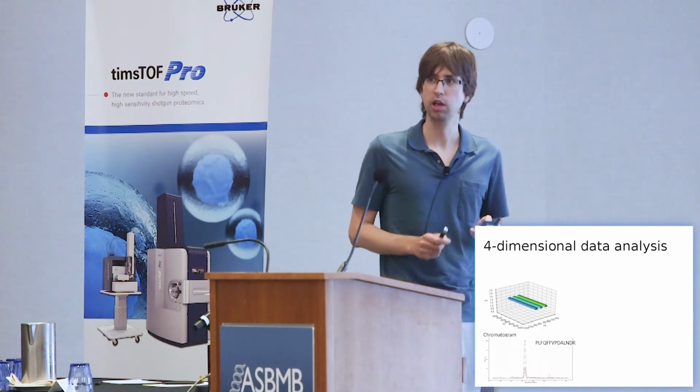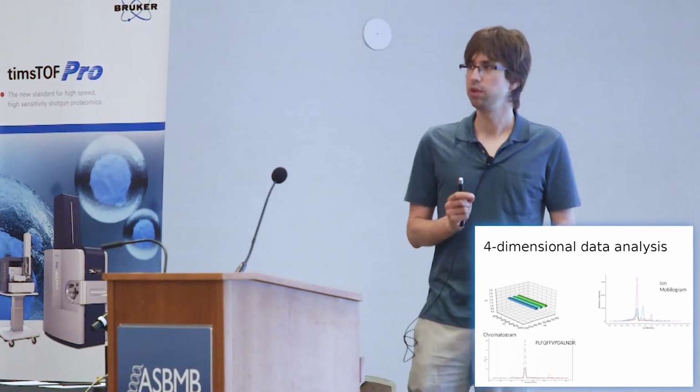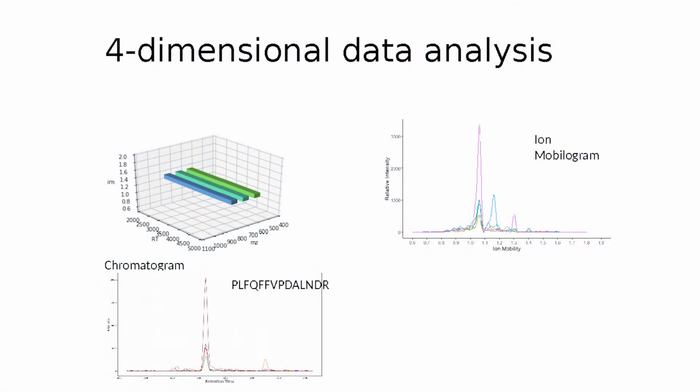However, additionally, we can now look in the ion mobility dimension, and here we see something very, very similar. We see a coelution of the 6 fragment ion traces as a function of ion mobility at the position of the precursor ion mobility. And so we realize that this is the elution time point of the peptide, because all of the fragment ions show a co-eluting signal here, whereas these other signals are signals that we are now able to exclude from our analysis.